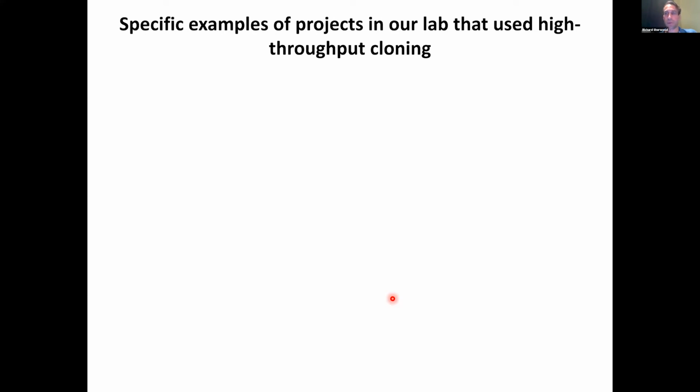If we're looking for gene sequences, we often use a site like UniProt or NCBI BLAST, or the UCSC genome browser, which we use all the time, since it has the complete genome sequences of any organism. So if you want to find a gene, the genomic DNA or cDNA of that, that's a great resource.